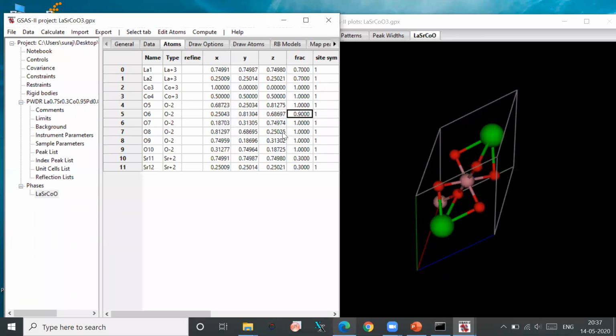And what you have said, that multivalent ions of the same element can make oxygen vacancy as well. For that, you have to incorporate it and play with it to see whether incorporating the oxygen vacancy actually helps or not. So am I clear, Sonat? Yes.